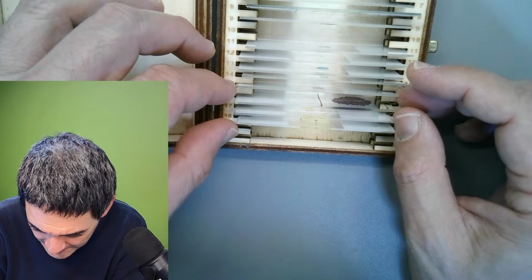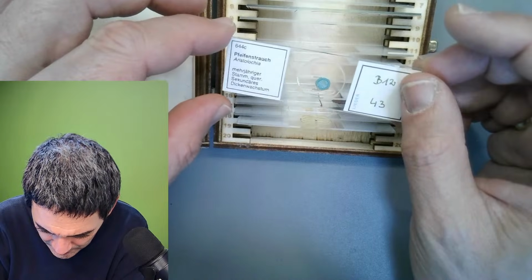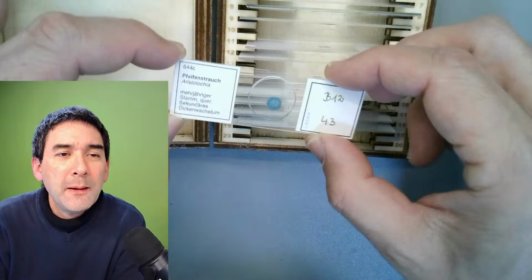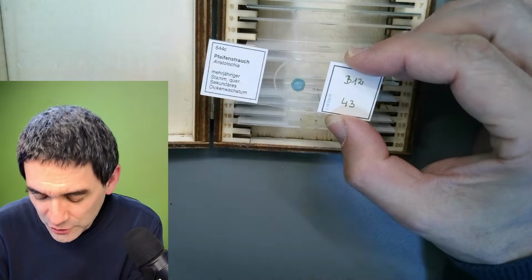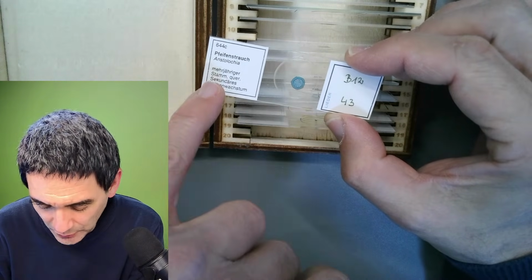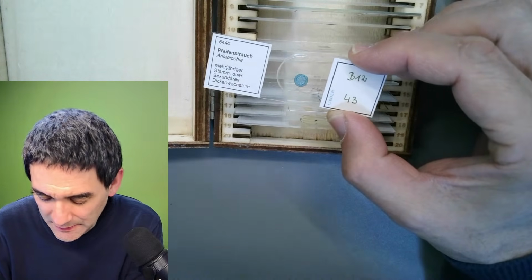So I'm going to jump ahead now. Where is this? Here, this is Aristolochia. That's it. This slide has a little history. This is basically the cross-section of a stem of a plant, Aristolochia. It's called just some plant, and it's a fairly large one.